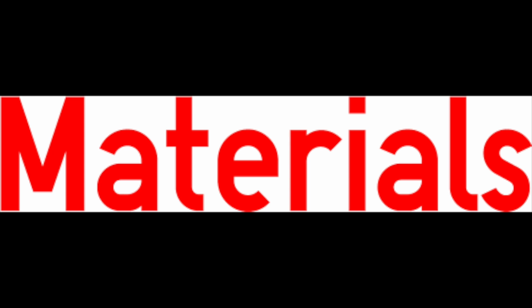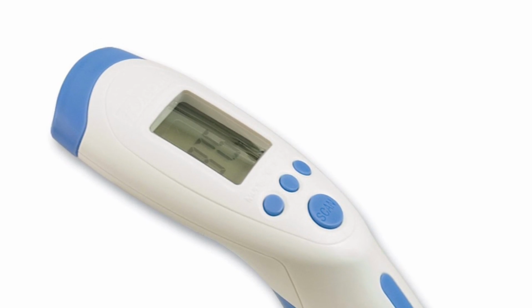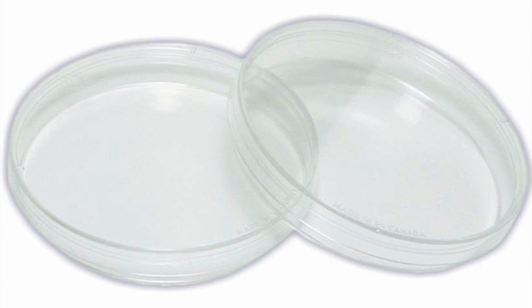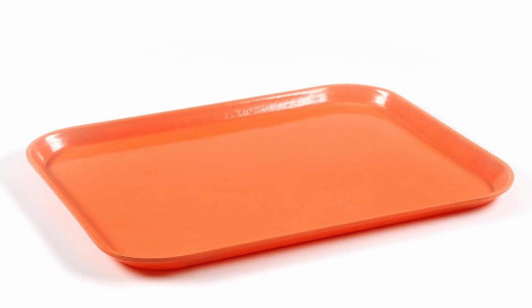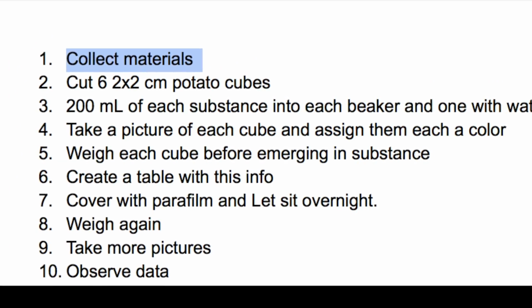In order to conduct the experiment, we used paper towels, russet potatoes, beakers, thermometers, a knife, a balance, a ruler, petri dishes, tweezers, the water solutions, parafilm, and a tray. In order to conduct the experiment, we collected all the materials.